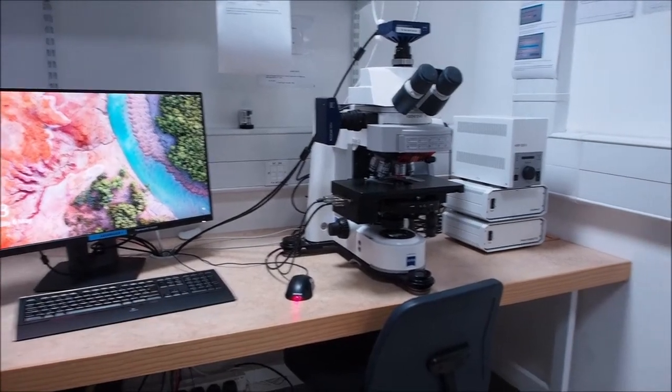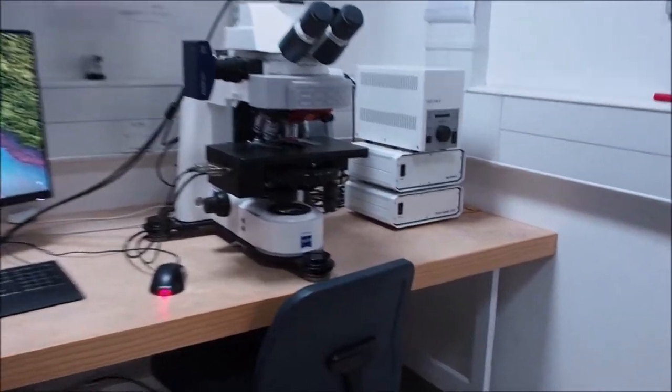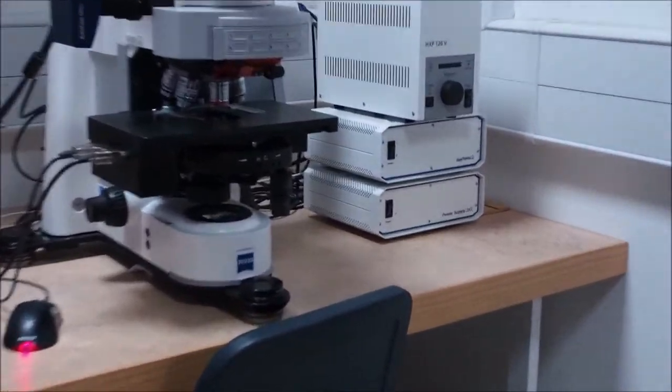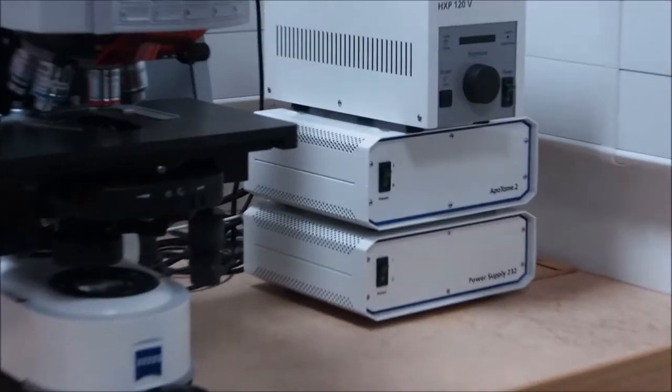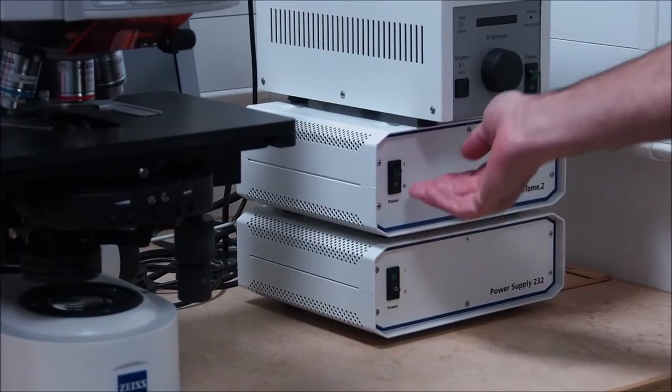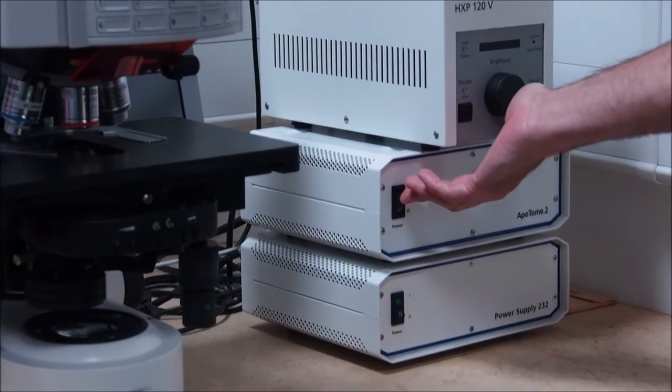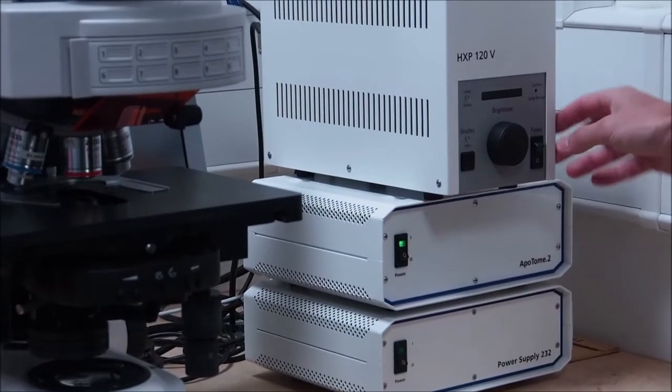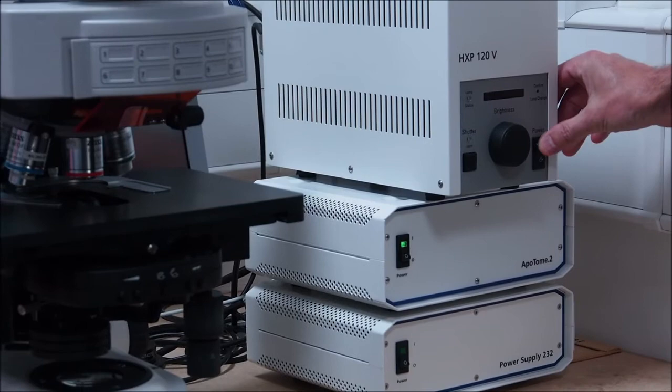This video shows you how to start up Zeiss Axio Imager 1. Firstly, switch on the three boxes on the right hand side. Then switch on the microscope power on the lower left.